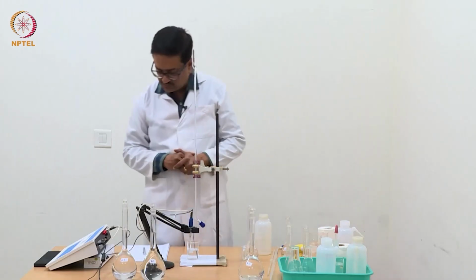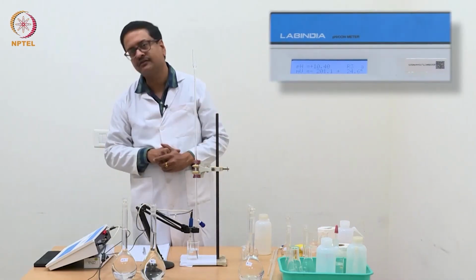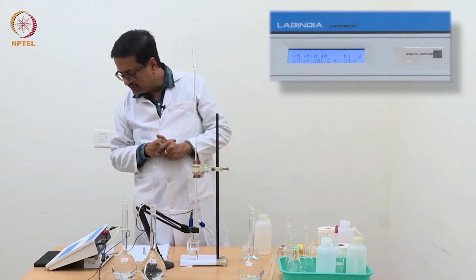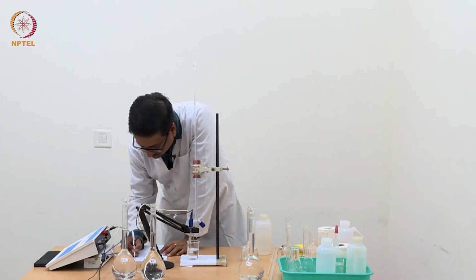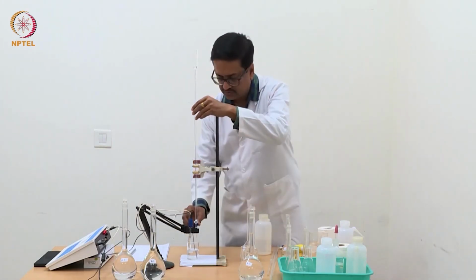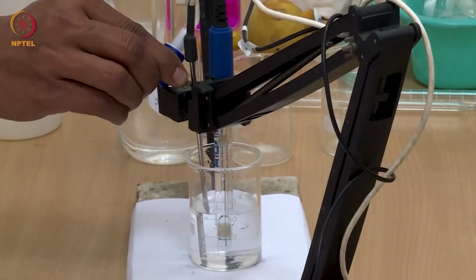Now I have reached 1.6 and you can see the pH is not increasing as it was increasing about the time when it was going through the equivalence point. It has increased to 10.40. So we will just take one more reading, which will be, suppose, 10.64. We are adding 0.4 ml at the moment.